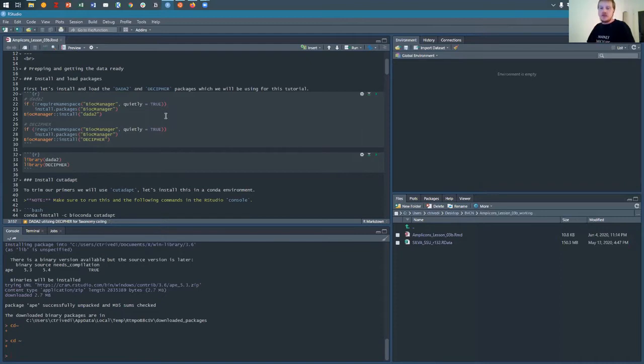Now, many people still use the naive Bayesian classifier, but for our purposes, we're going to try the new IDTaxa algorithm that's part of the DECIPHER package to do our taxonomy assignment. But that won't come until a bit later.